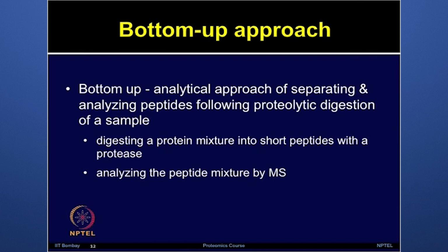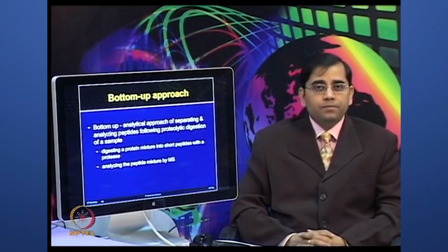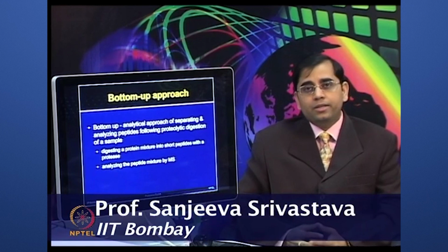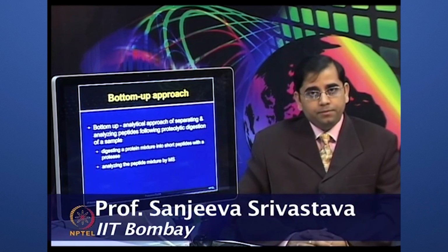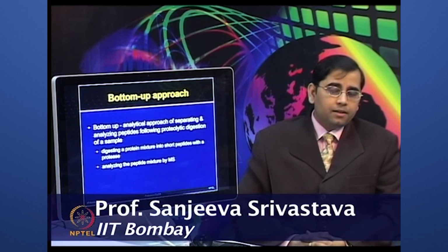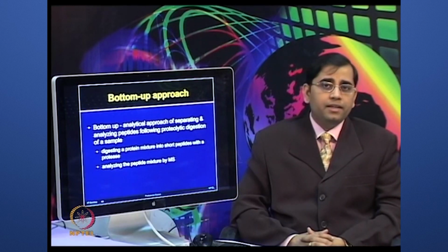First of all, proteins are digested by using trypsin or some other proteolytic enzymes. Peptides are separated by using liquid chromatography and introduced inside the mass spec. Peptides fragment inside the MS, and proteins can be identified by using databases.